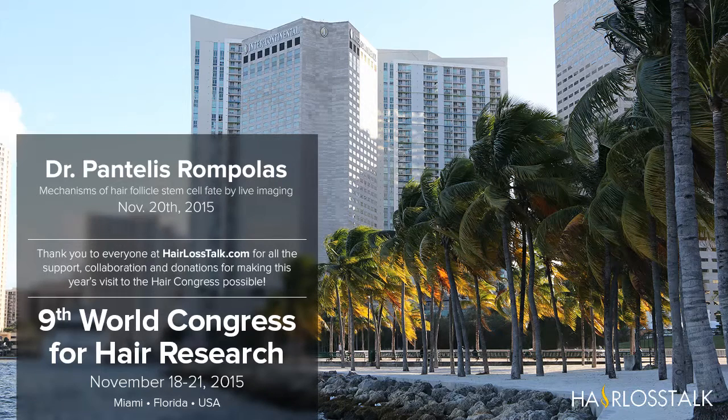If we trace individual clones and do three-dimensional reconstruction, we often see these leaving a single plane. So it's what you described, maybe going around the hair follicle, but it's not a clear circular motion. It seems almost chaotic. So they all migrate down, but they obviously do it individually from each other because we often see cells crossing paths. So it's not a clear stream going down, and this has implications for what the connections are between these cells, the lateral connections. There has to be certain fluidity to support these, but we don't understand the cellular mechanism. That's fascinating. Great, thanks very much.